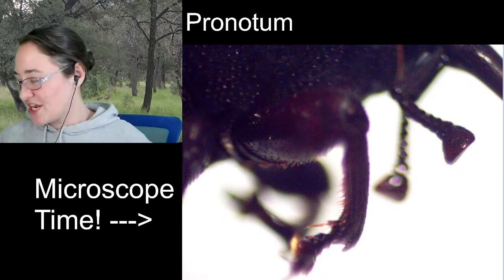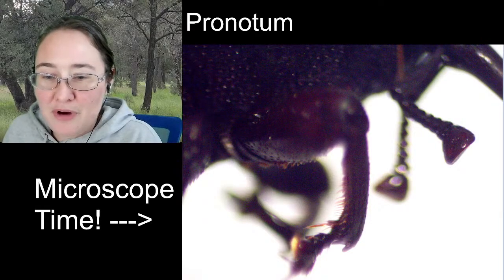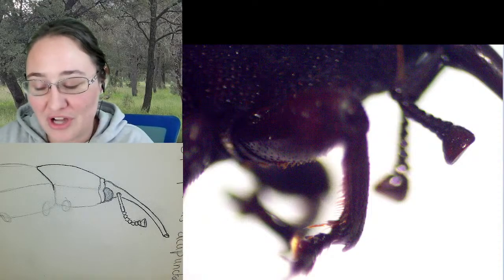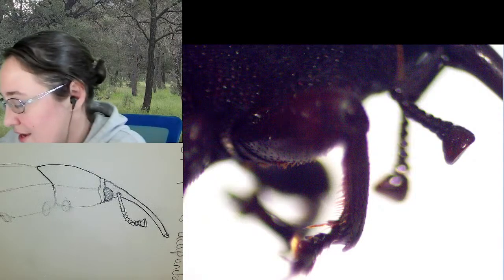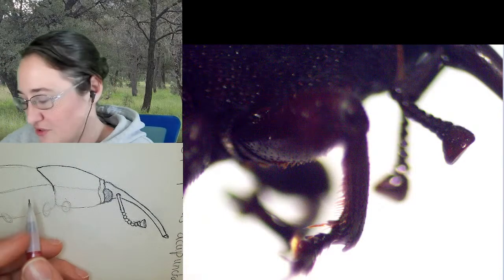Alright, so I was just getting us a good view for this front leg here. So we're looking at the pro leg. No, it's not a pro leg. That's funny. We're going to call it the front leg. And it is considered a walking leg. It's not adapted for jumping or swimming or doing anything like that.